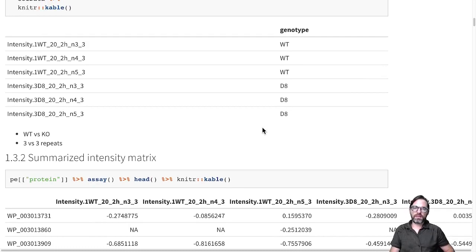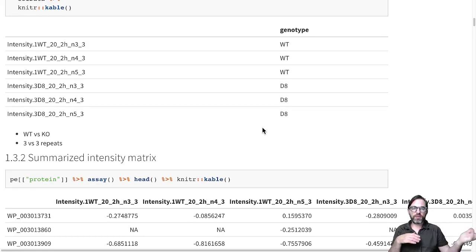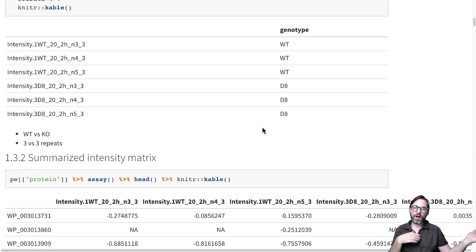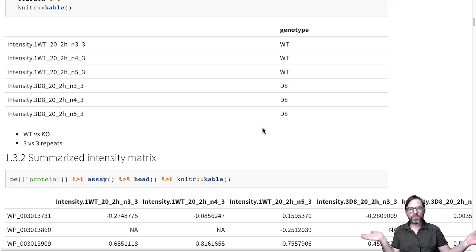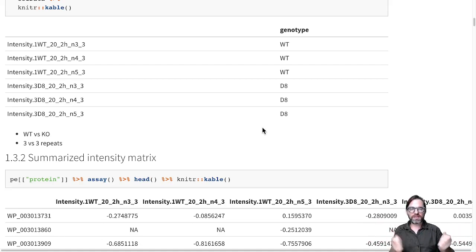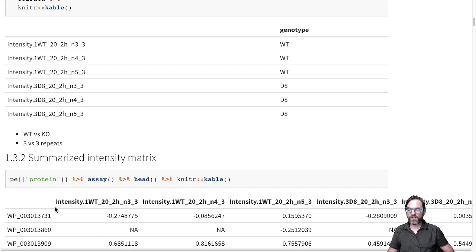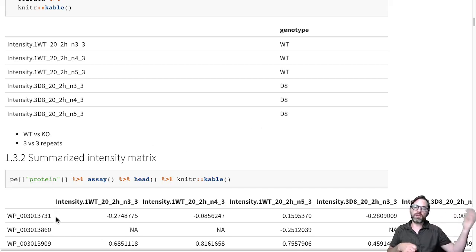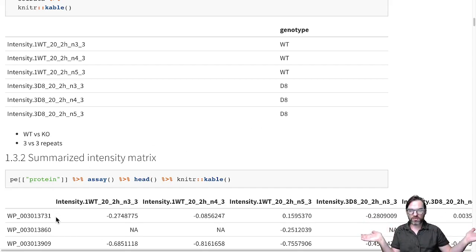we see that in our experiment we clearly have a three by three comparison. We have three wild type samples and three knockout samples. And now we will have to assess differential abundance of each of these proteins between the wild type and the knockouts.